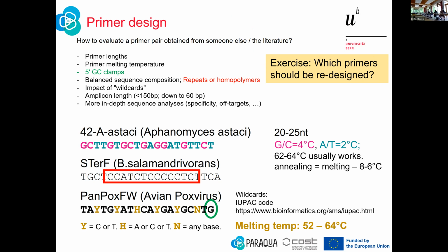In this case, I brought two exercises, which we will not do now, but we can look at them in the afternoon during the practicals, and I can give you feedback. One is a sheet. Look at these primers and look at which ones should be redesigned. Which ones are bad, which ones are good. Give us feedback.